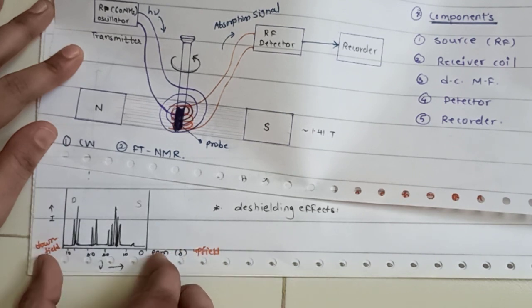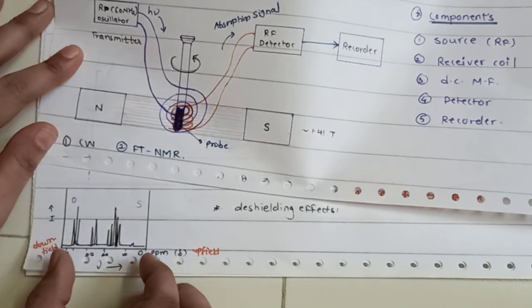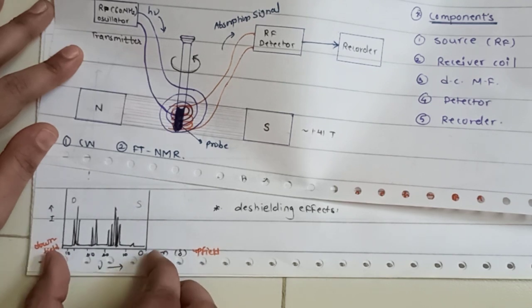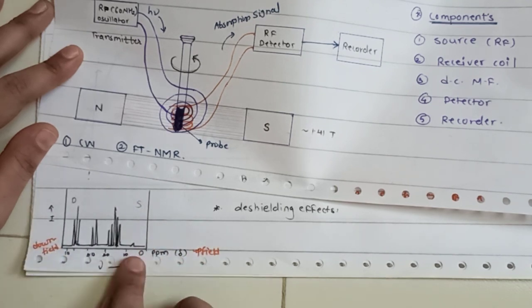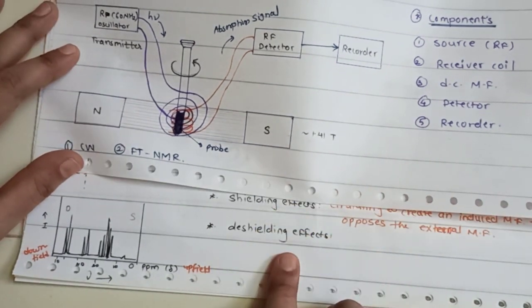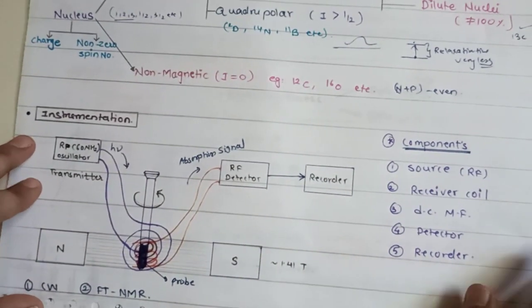अब यहाँ पे 2 पार्ट्स है your NMR spectrum. The right hand side part will be considered as upfield, the left hand side part will be considered as downfield. So the area which is actually denoted in the NMR spectrum, the frequency part, this horizontal line, is considered as the chemical shift values. Those totally depend upon two factors, the shielding effect and the de-shielding effect. So this part I am going to cover in the next part. तो फिलहाल हम लोग पहले इतना समझ लेते हैं.